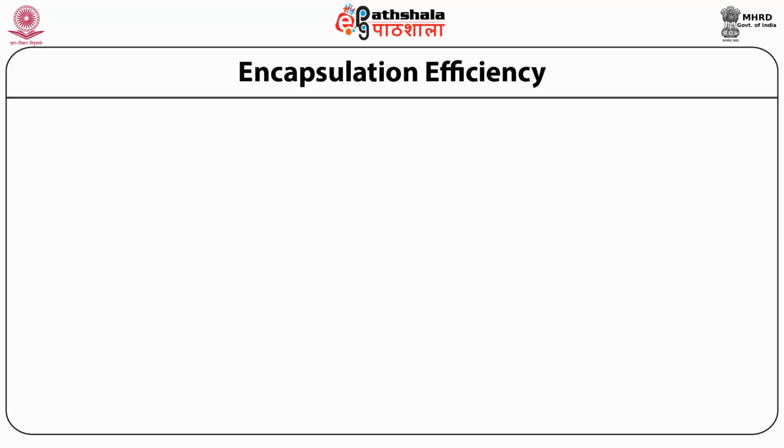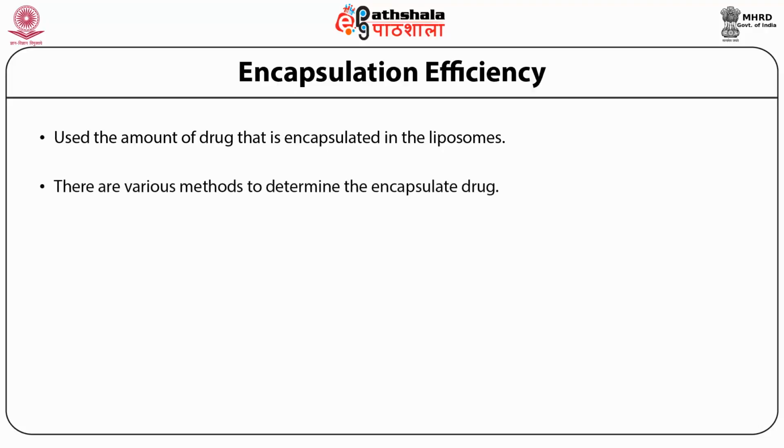Encapsulation efficiency. The encapsulation efficiency of liposomes accounts for the amount of drug that is encapsulated in the liposomes. Determination of the encapsulation efficiency is important since it dictates the amount of the formulation that should be administered so as to deliver the therapeutic concentration of the drug. To determine the true amount of encapsulated drug, the unencapsulated drug must first be separated from the drug-loaded formulation. This separation can be accomplished by any of the various methods available.